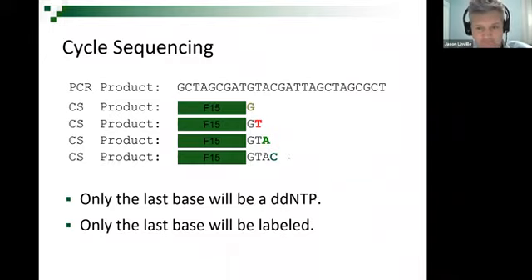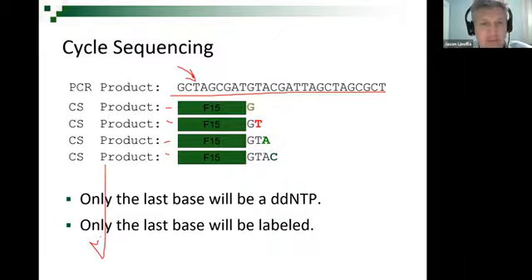Okay. All right. So when we put our amplified DNA through this cycle sequencing reaction, during the first time through the reaction, remember, there's millions of copies of these. So I'm showing you 4 possible things that can happen, but this actually happens millions of times. Okay. So as you separate the DNA and cool it down, again, we have 1 million copies of our amplified DNA.